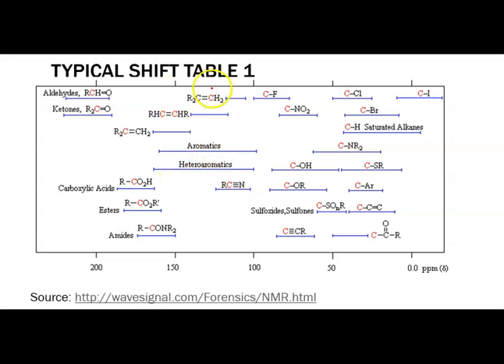Here we see carbons with double bonds. Far to the left, we see those characteristic C double bond O. Now, don't be fooled. This carbon here is actually attached to that oxygen. Okay, you have to remember, an aldehyde has a carbon double bond oxygen. But the way they drew it here, if we put the H on the oxygen, then we would think it's an alcohol, and that's not what we want to do here.